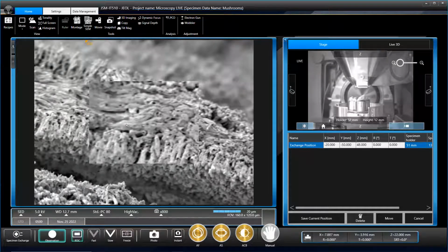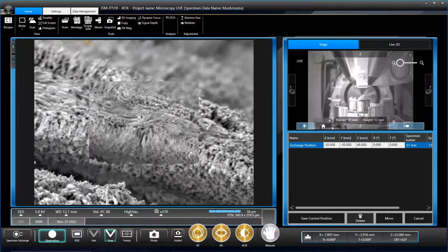So these are edible mushrooms you've got from the shop. Yeah, this is microscopy in unnamed supermarket. The idea is, when they're commercially producing them, they harvest them before they generate their spores. If we were to get them from a field, maybe you'd see lots more spores. But they look messy, so that's why they don't want to pick them after they've dispersed their spores, for us at least. Very cool.